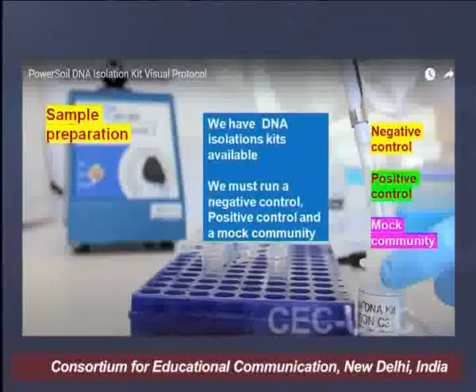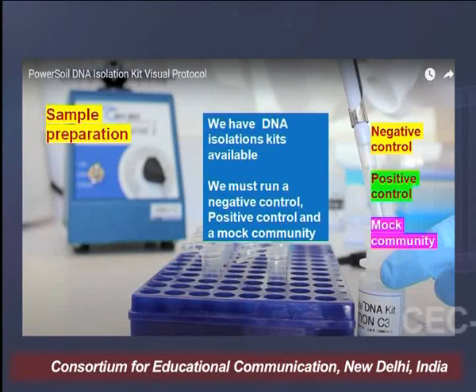Let's take them step by step so that you understand what is happening in your data and what your data contains. So we take a sample, and when it is a gut microflora, it's a simple biopsy sample which has been taken from any patient. With this biopsy sample, you will isolate the whole DNA.